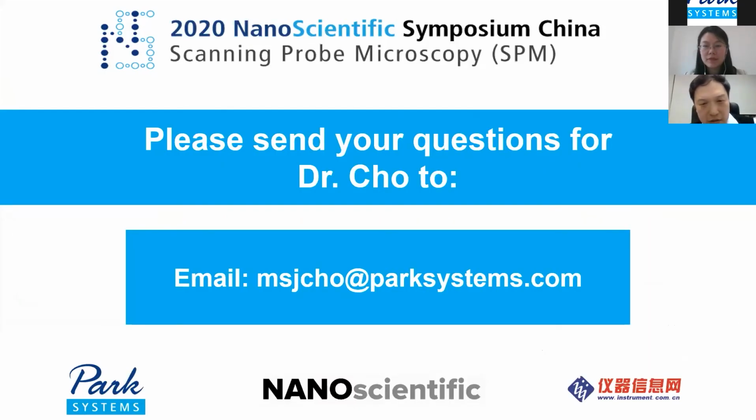Yeah, we have received several questions, and the first questions are basically the same. They are asking about the lateral resolution of Raman collected simultaneously with AFM map. So Raman resolution, currently it's equipped with just a normal Raman. It's maybe a little bit bigger than nano Raman. So right now it's about 300 nanometer resolution. And we are also testing TERS together. In TERS, we are testing lateral resolution of less than 50 nanometer, and 30 nanometer. Okay, thank you very much for the answer.